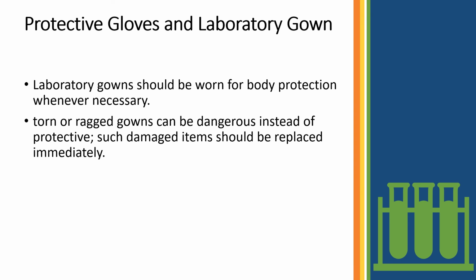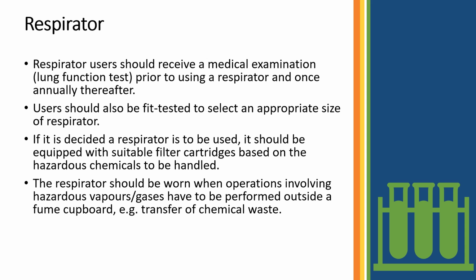Protective gloves and laboratory gown. Laboratory gowns should be worn for body protection whenever necessary. Torn or ragged gowns can be dangerous instead of protective. Such damaged items should be replaced immediately.